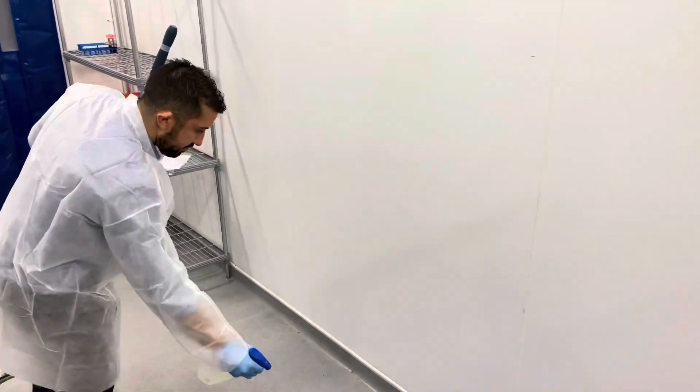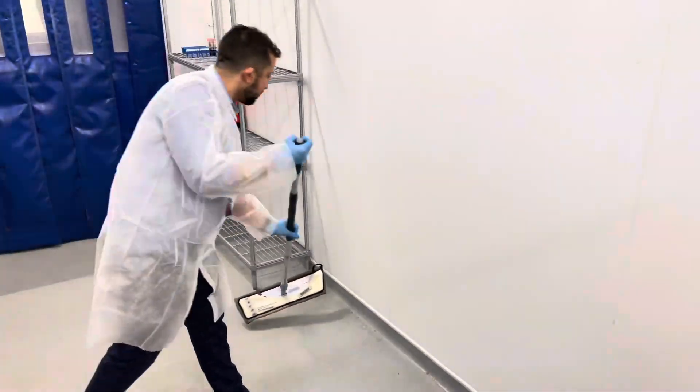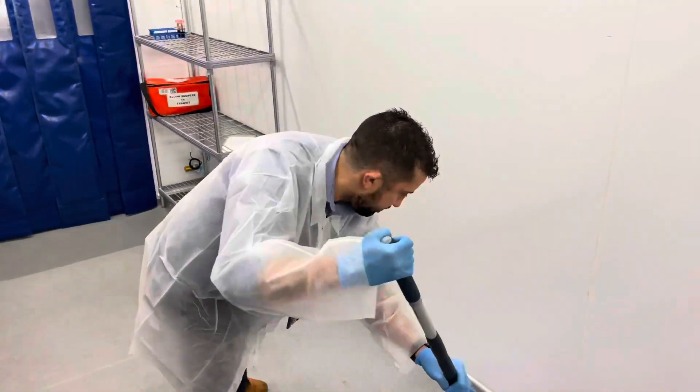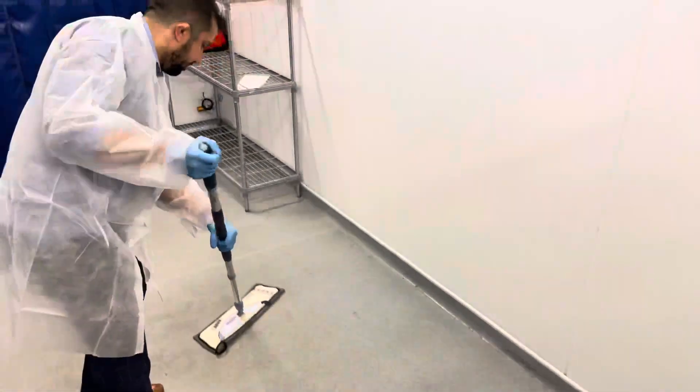The floor should be done in a similar way, first by spraying the micro clean detergent and then mopping over the top. Remember, you must use a different mop for the floor.